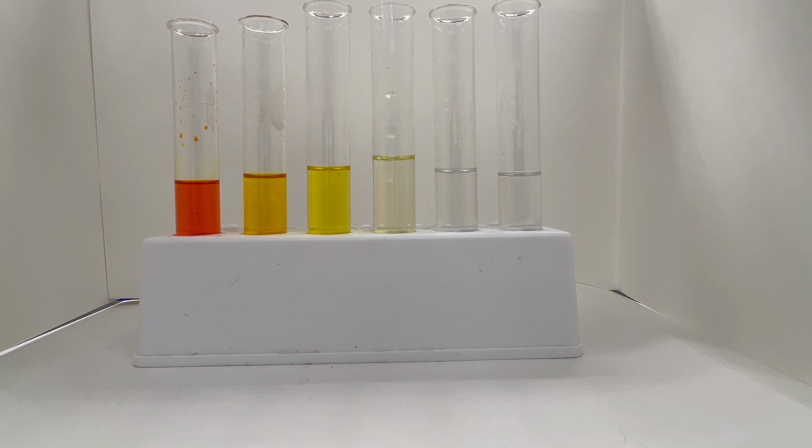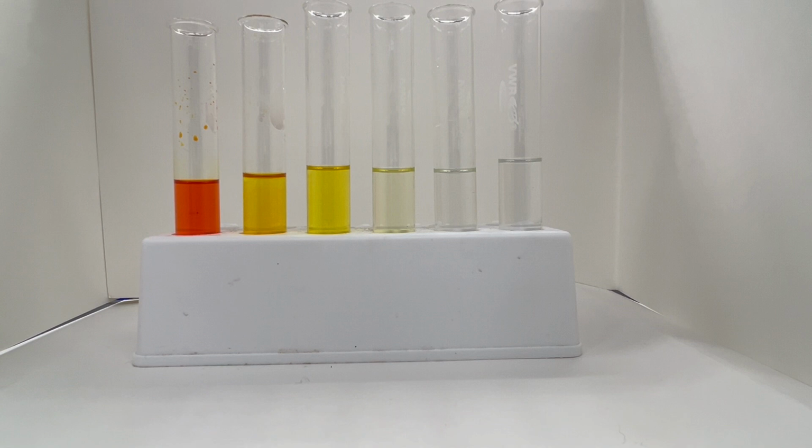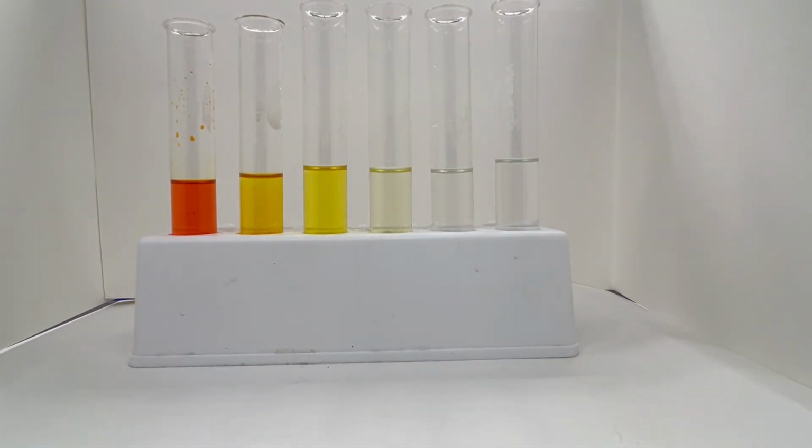Next, add 9 units of your solvent to the container. If you measured 1 milliliter of stock solution, you'll add 9 milliliters of water. After adding the solvent, mix the solution thoroughly to ensure even distribution of the solute in the solvent. Now you have a tenfold diluted solution.